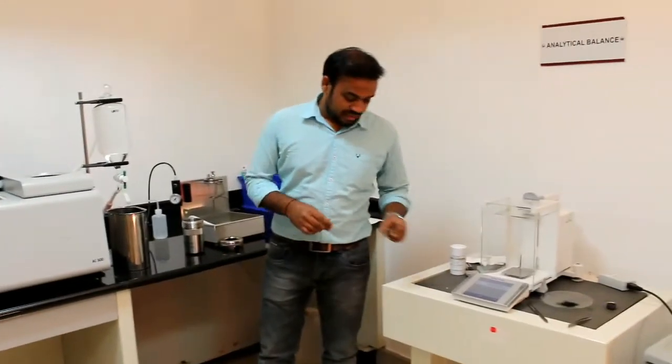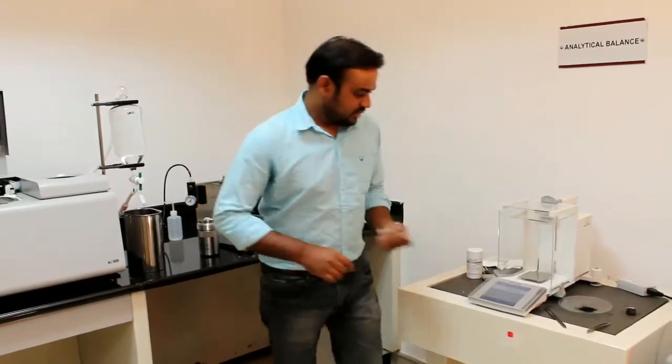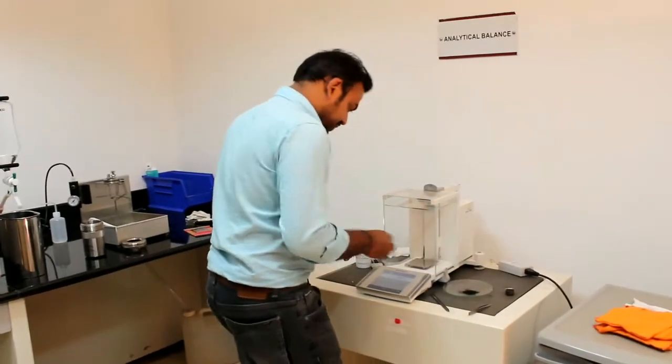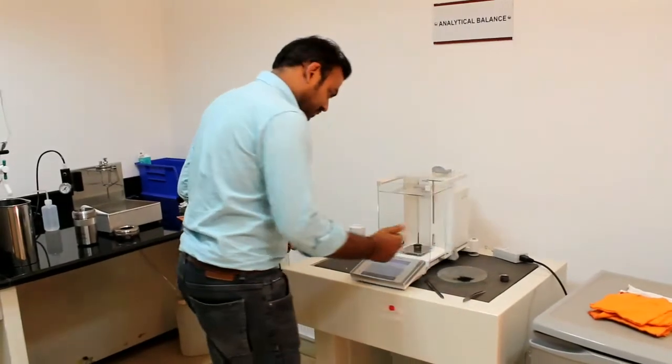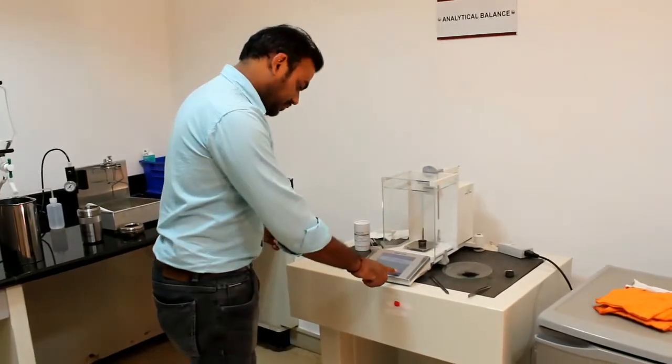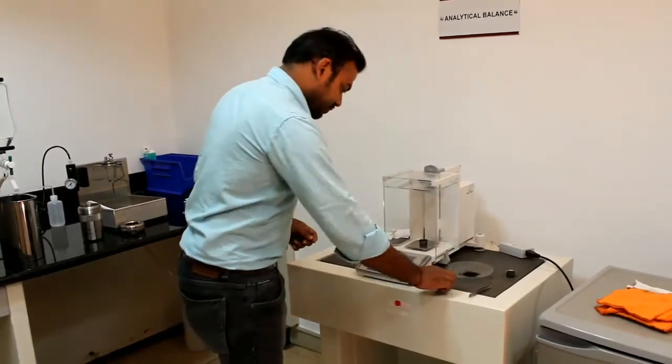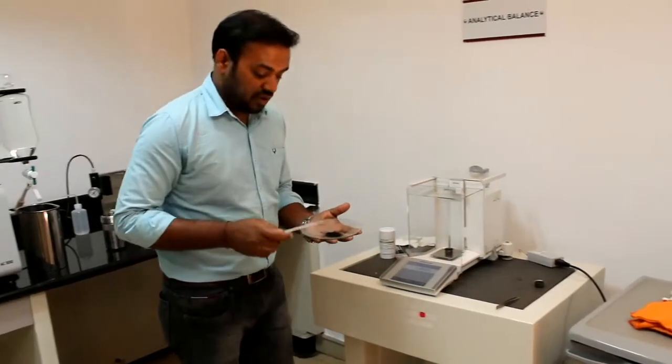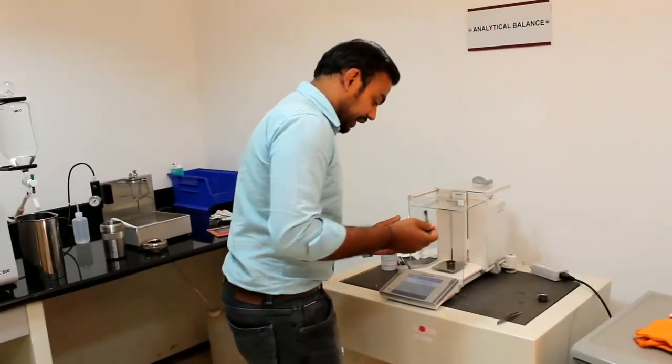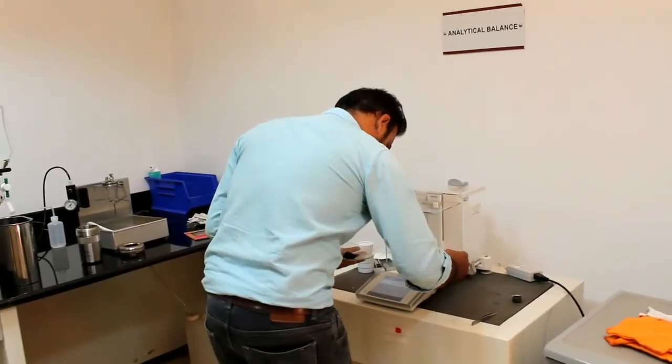Initially, we will take the sample in this crucible. First, we will weigh the sample. We will tare it now. So we are doing a coal sample. We will take approximately around 1 gram.